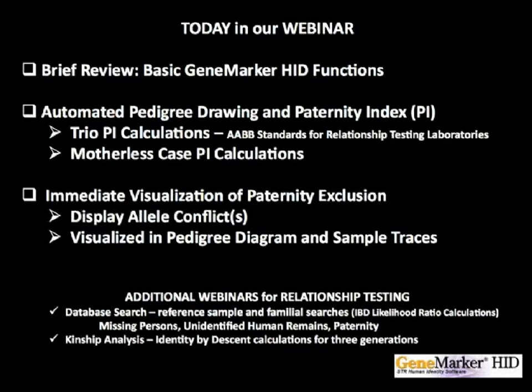In today's webinar, we will briefly review the basic GeneMarker HID functions before using a demonstration set of data in the paternity testing applications of GeneMarker HID. These include automated pedigree drawing and paternity index calculations. The program uses the equations from the Association of American Blood Banking, AABB, the standards for relationship testing laboratories for trio PI calculations and motherless case PI calculations.